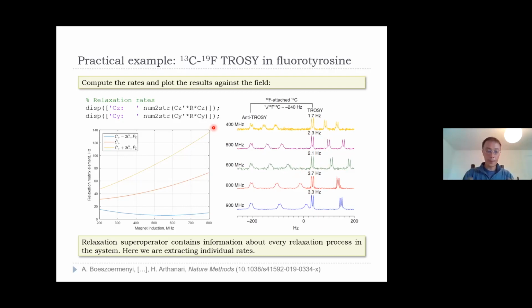You plonk the system parameters in, in this case we read them from the DFT calculation. And as you can see, there's a certain need to know what you're doing, in that at least you need to know what the relaxation superoperator is and enough linear algebra to know how to extract an element out of a matrix, no way around it. But at least we have spared the end users the really horrendous relaxation theory, because that is really difficult. So SPINACH just returns you the matrix, and then you do with it what you will.